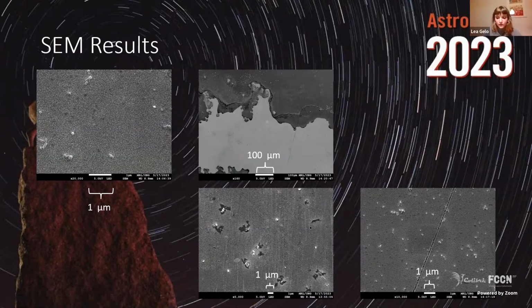And also you might ask yourself, what's with the methanol from the solution? Well, it evaporated during the spin coating, so we were only left with the layer of the molecule. And you can see some interesting pictures here. For example, these white blobs are thought to be some sort of dust particles that fell onto the sample. On the second picture on the top, you can see a sort of splash, and you can conclude from it that this BODIPY molecule was not nicely distributed, since we have the splashes from depositing the solution with the micropipette on the substrate.